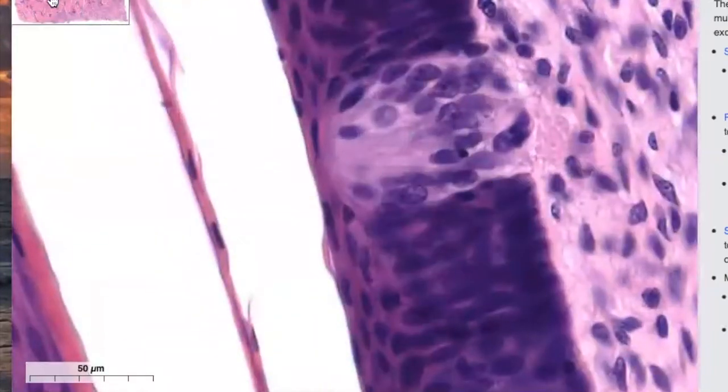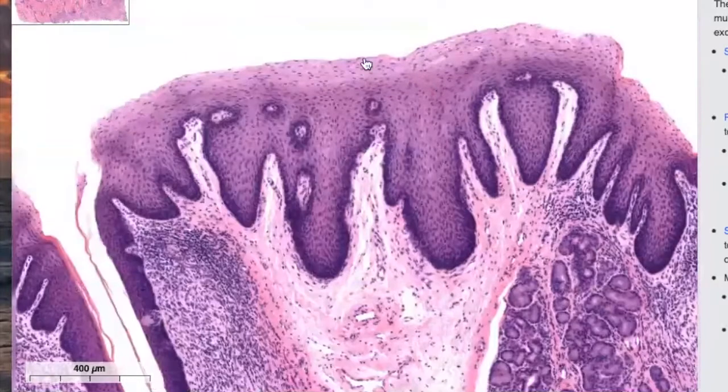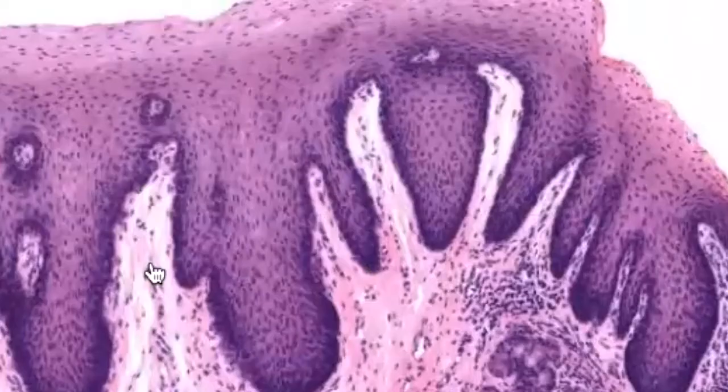Okay, and then moving out. Right, the surface, just like all your mouth and your esophagus, is going to be lined with that stratified squamous, right? So this kind of looks like your skin a little bit. It's even got dermal papilla.